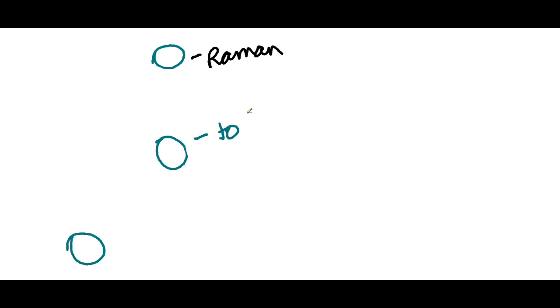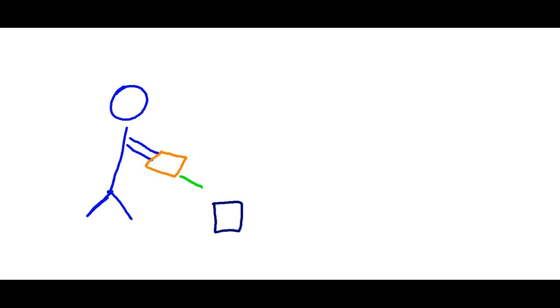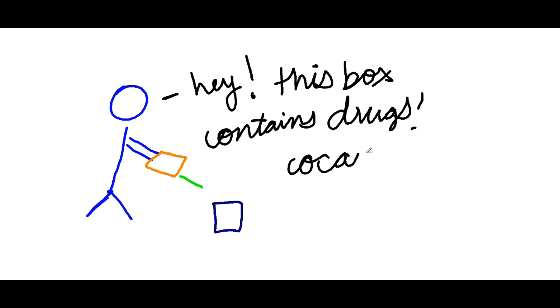So I've told you what Raman spectroscopy is, but why did I tell you this? What are its applications? One device that uses Raman spectroscopy helps emergency responders and law enforcement officials by detecting explosive threats and identifying narcotics, illegal drugs, and hazardous materials. Another device can even identify the raw materials of pharmaceutical and cosmetic ingredients.